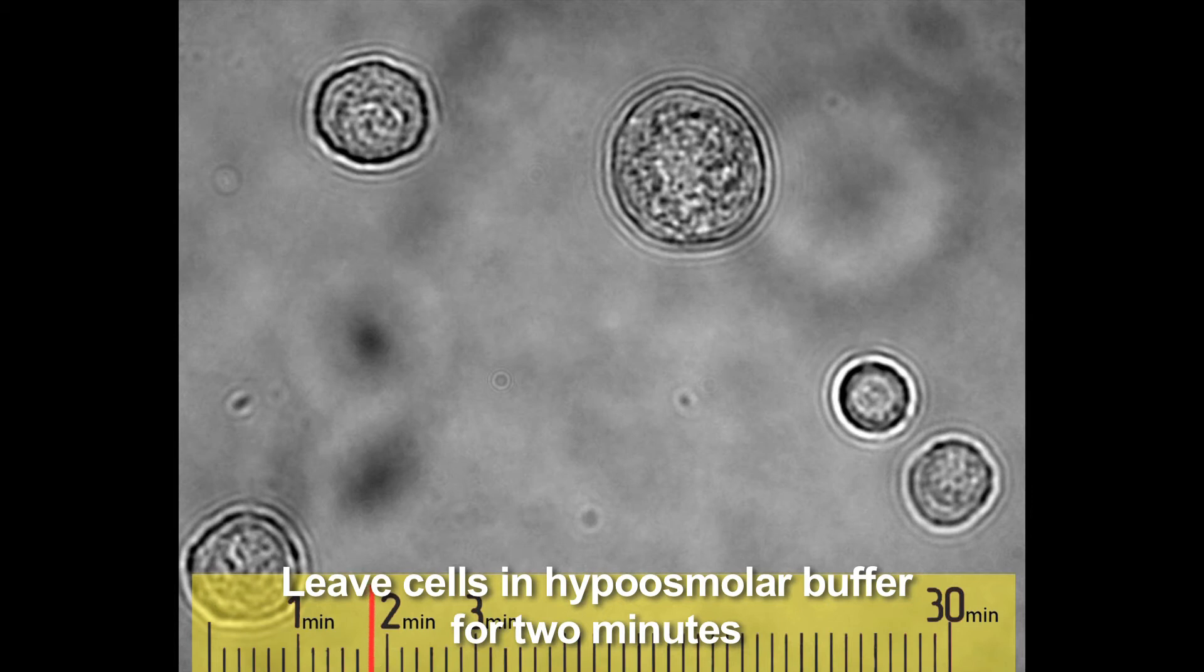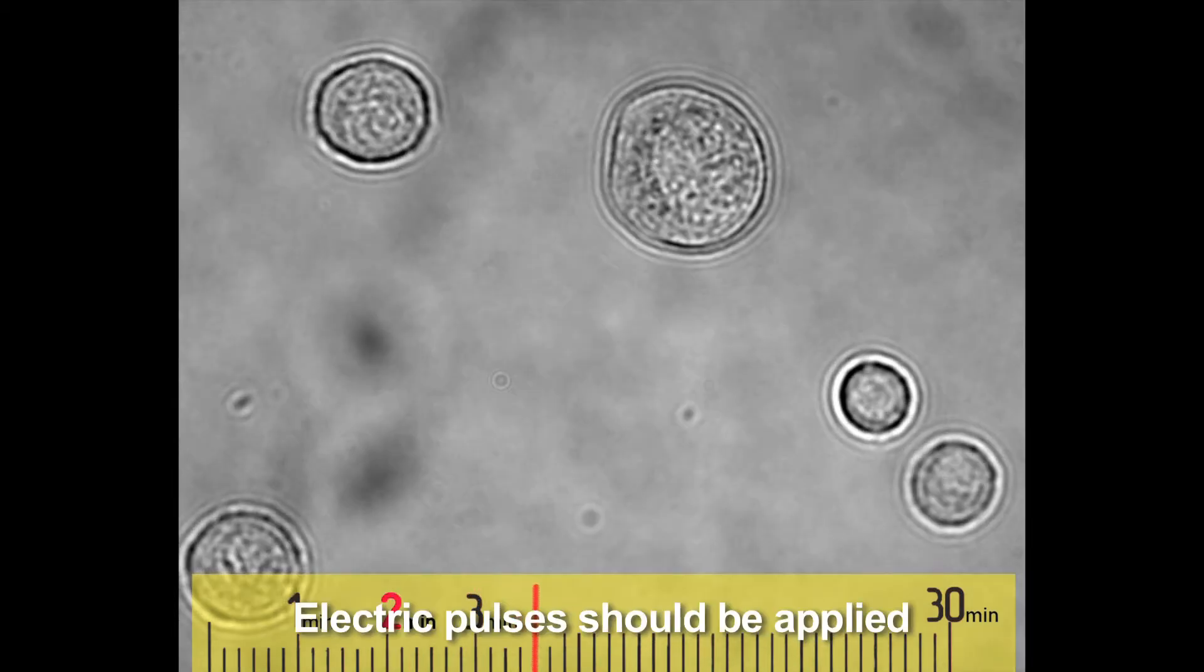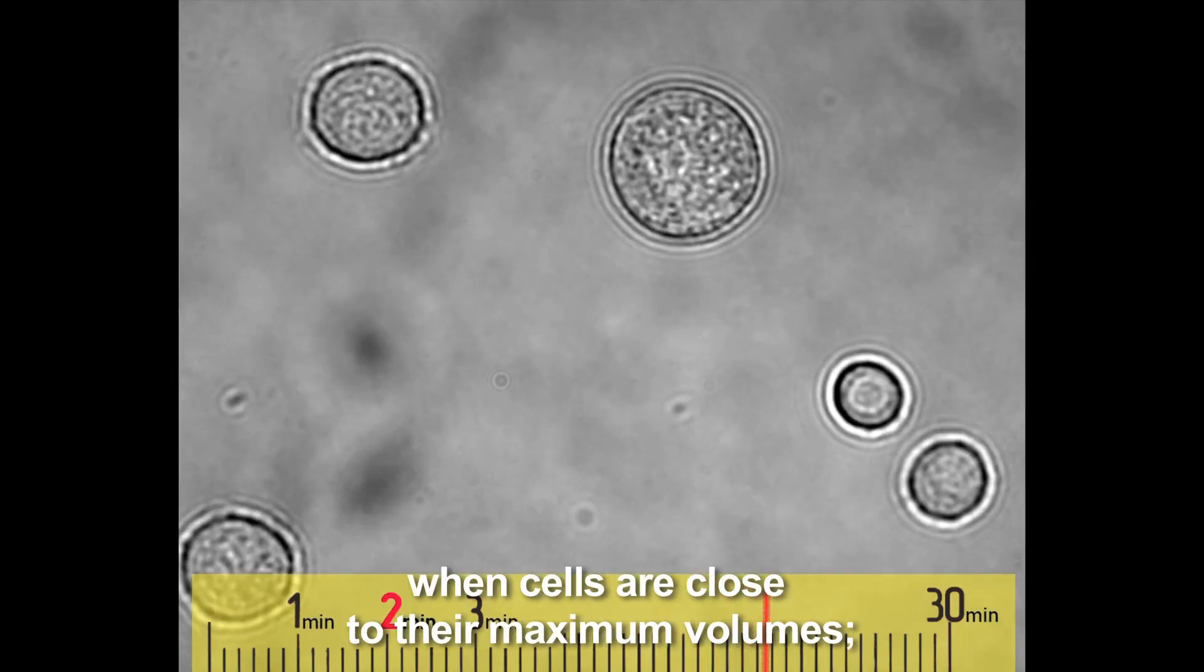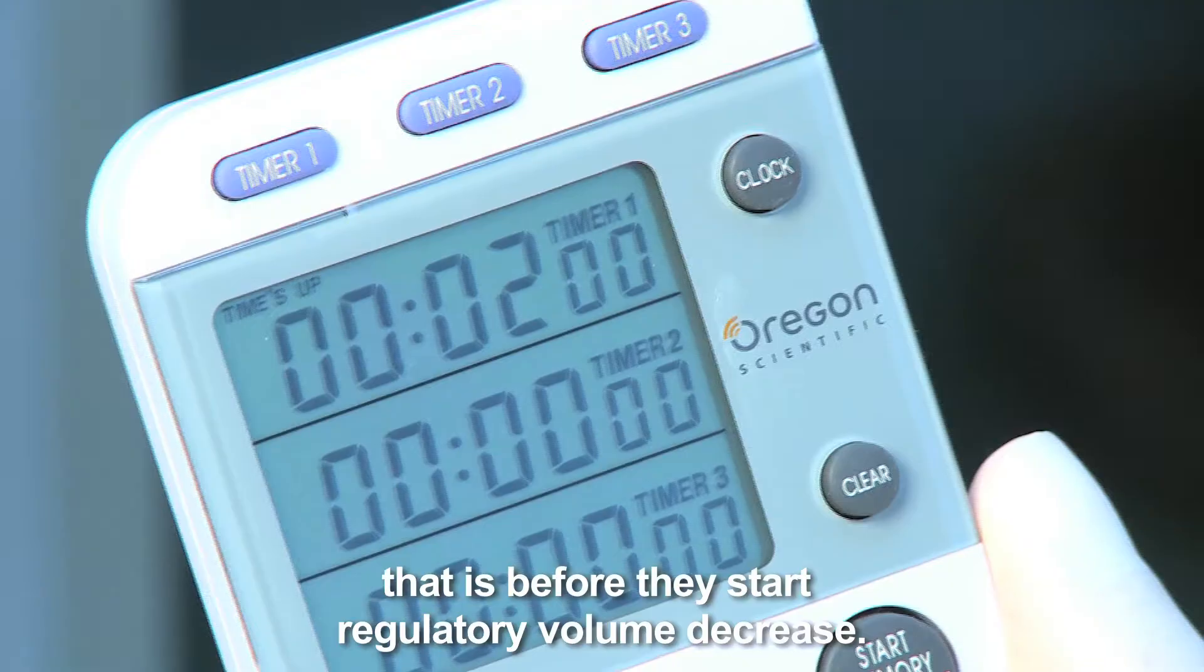Leave cells in hypoosmolar buffer for 2 minutes before applying electric pulses. Electric pulses should be applied when cells are close to their maximum volumes, that is, before they start regulatory volume decrease.